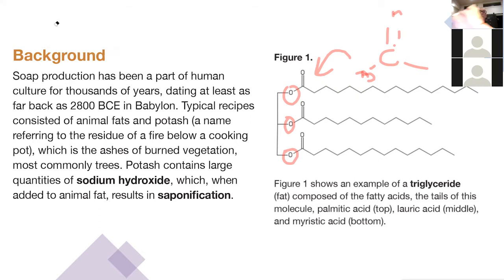You will have sodium from the sodium hydroxide, and you'll have the alcohol groups put back on the glycerol. That reaction is called saponification, because it's specific for these long fatty acids. It's called a triglyceride because we have 3 fatty acids, and the glyceride part comes from glycerol.